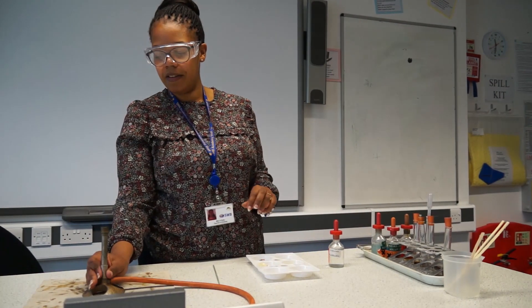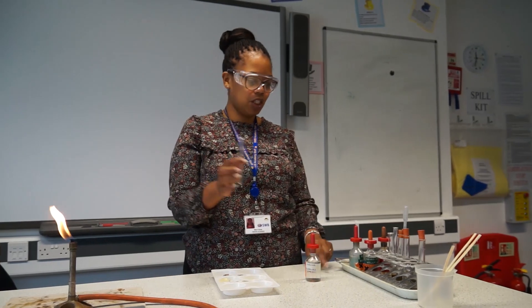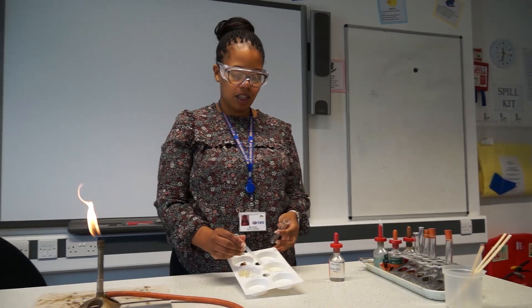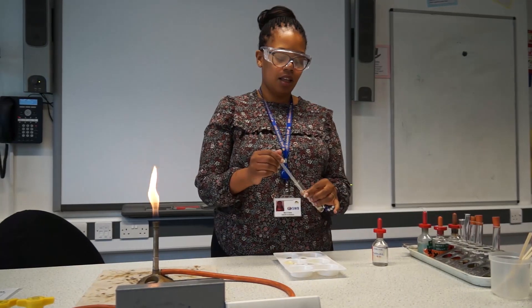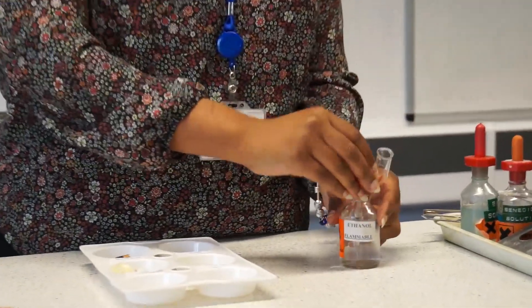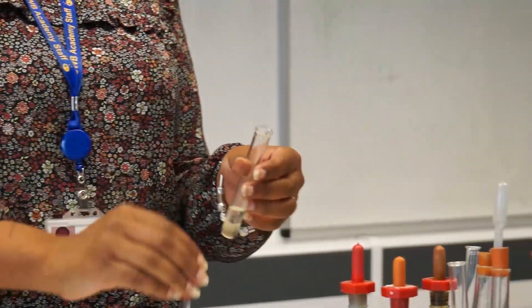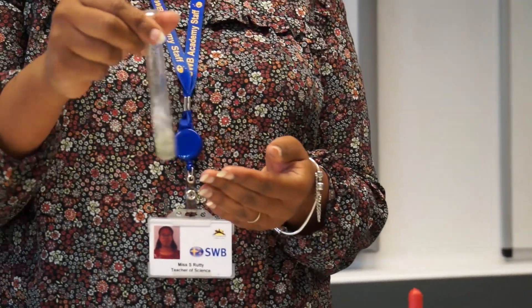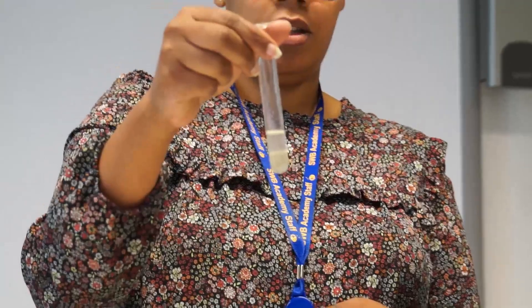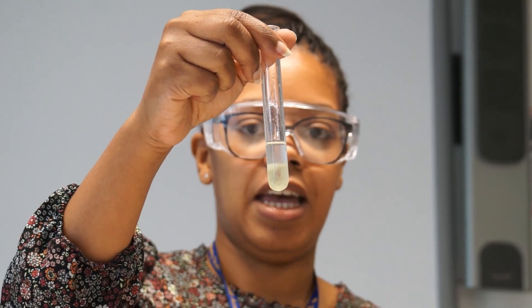Put the Bunsen burner back on its safety flame. This is our last food test and we're testing for the presence of fats. We take a clean test tube and pipette up some of the olive oil, which is a fat. We're going to use our last chemical, which is ethanol. A positive result for fats is that we get an emulsion formed. There you can see an emulsion has been formed, and that's a positive test for fats.